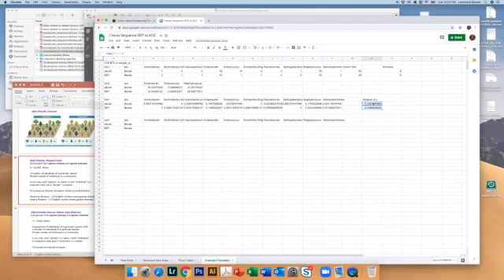And the reason they're difficult to interpret is because the way the Simpson index is calculated, larger values mean less diversity. And that's not very intuitive. So typically what we would do is calculate two other things, either a reciprocal Simpson value or an inverse Simpson value.